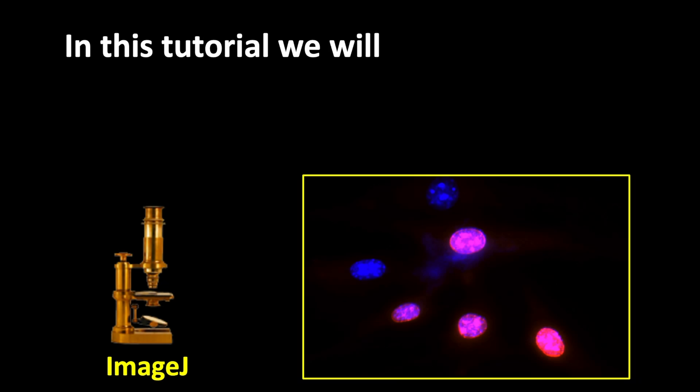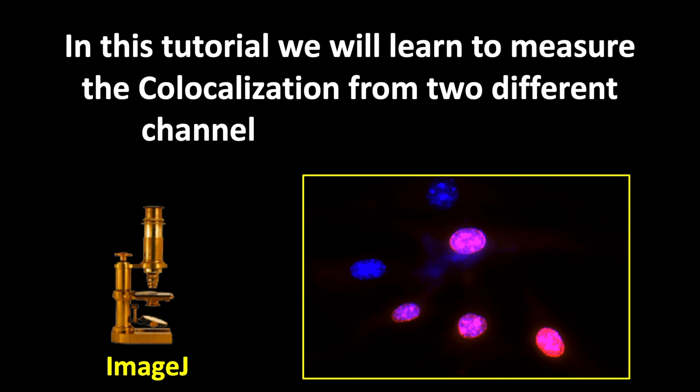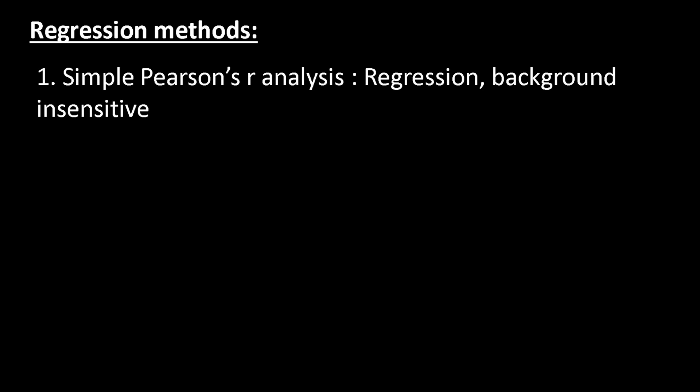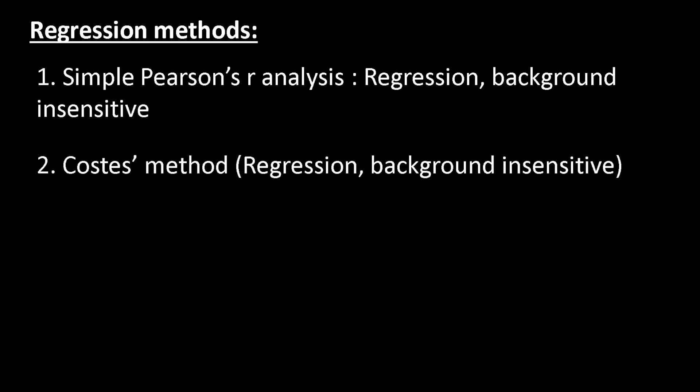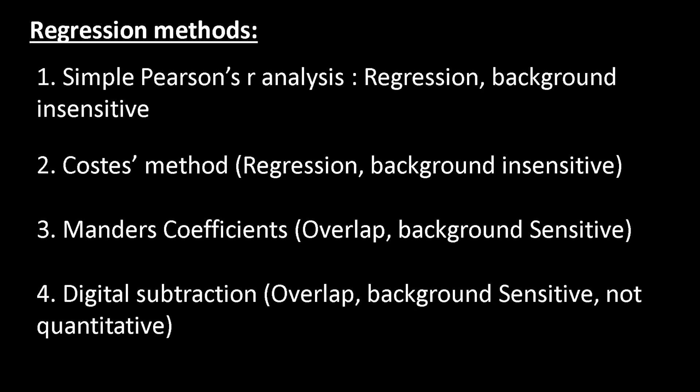In this tutorial we will learn to measure colocalization from two different channel images using ImageJ. We will use regression method for R analysis. For this tutorial we will use simple Pearson's R analysis that uses regression method and is background insensitive.